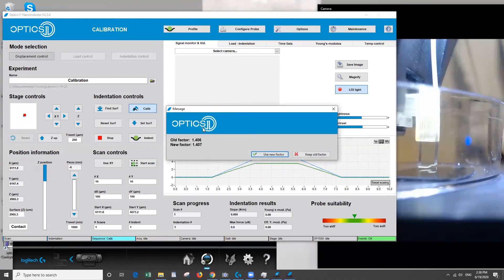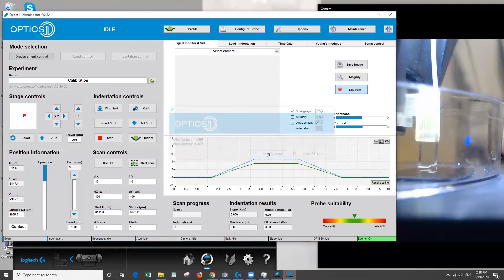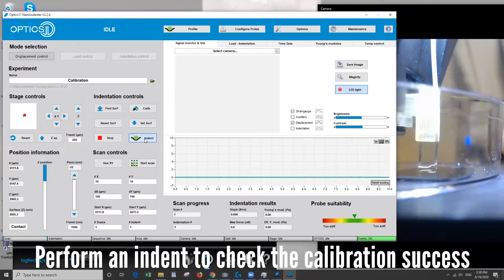Okay so once the calibration is complete it's going to give you a geofactor. Make sure this number is less than two and seems reasonable. If it is then we'll use the new factor. What we're going to do now is perform an indent to check that the calibration was successful.